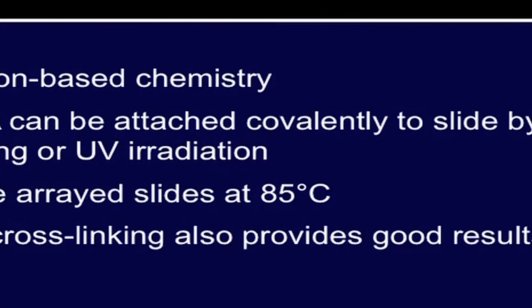These surfaces can be appropriately fabricated using different types of chemistry including amino groups or thiol esters. Let us first focus on silane based chemistry. We will talk about printing DNA on the array surface for using cell free expression based NAPPA microarrays. Silicon based chemicals contain two types of groups, such as alkoxyl groups like methoxy or ethoxy, or organofunctional groups such as amino, epoxy, vinyl, etc.